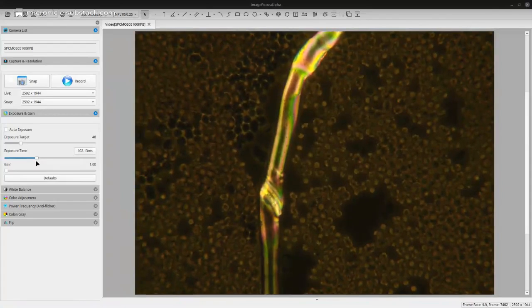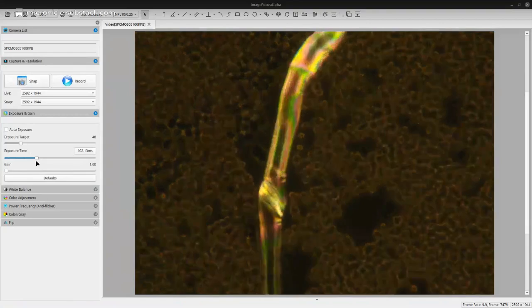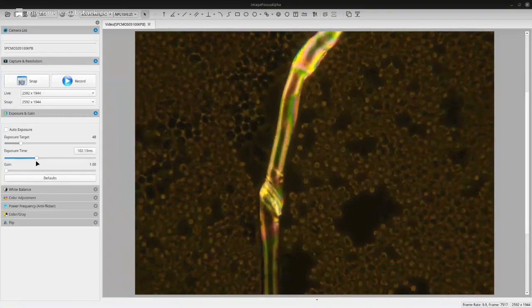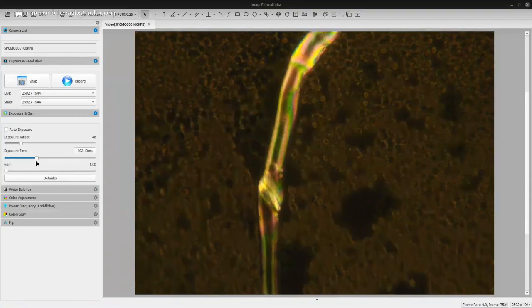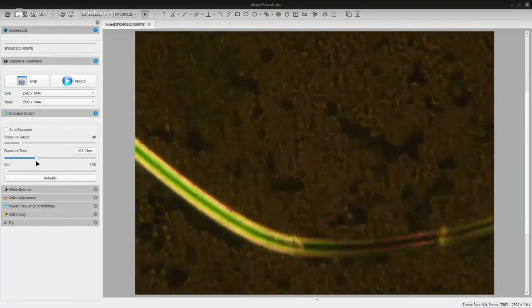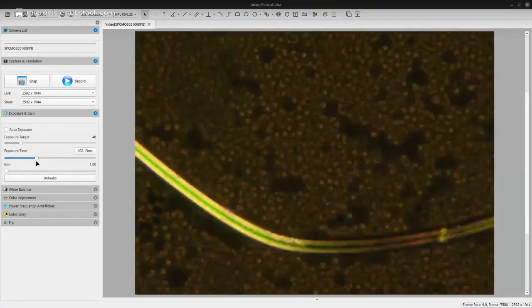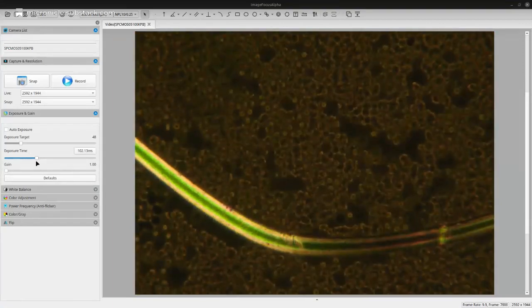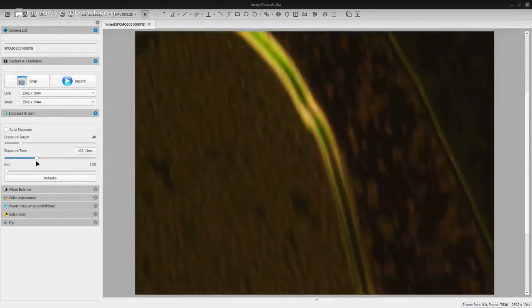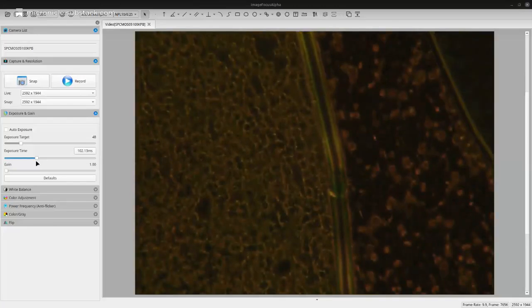So it's a highly ordered structure, as fungi are. This long length seems to be fairly consistent. The odd buckle in it.